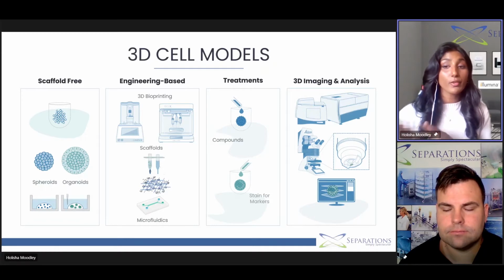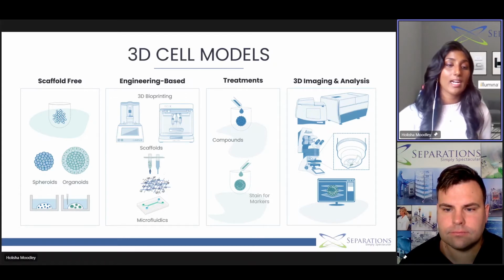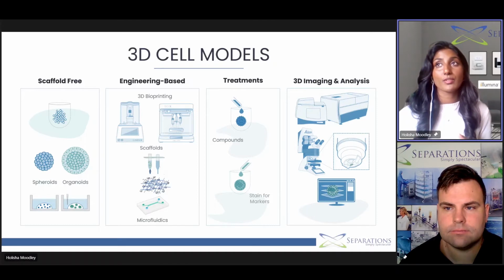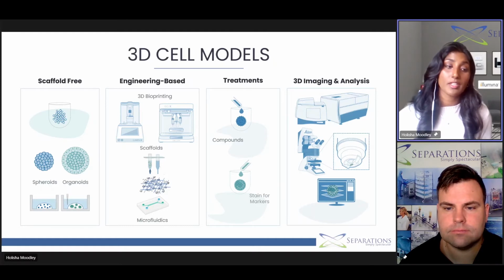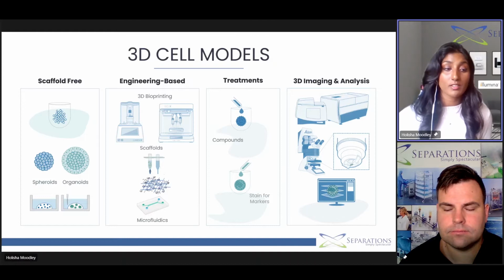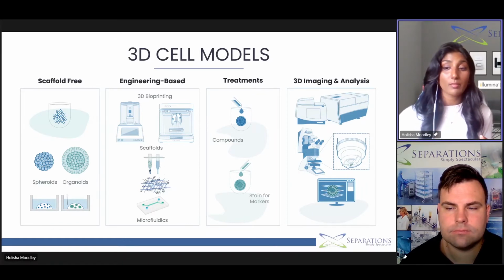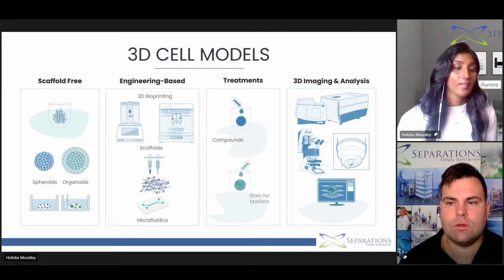We can use 3D confocal imaging systems to not only observe the X and the Y, but also the Z axis of our sample. And this produces a lot more physiologically relevant information. We can produce high resolution imaging of these 3D models using different approaches in microscopy, such as digital light sheet, which you can achieve using the Leica confocal system. 3D models have become very important and relevant in many other cell culture workflows, such as drug discovery and in cancer research.